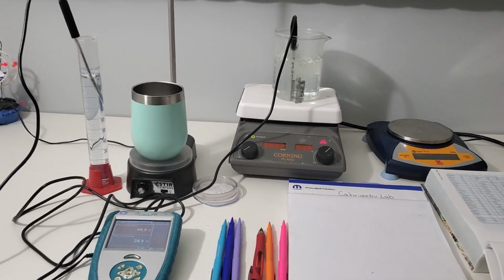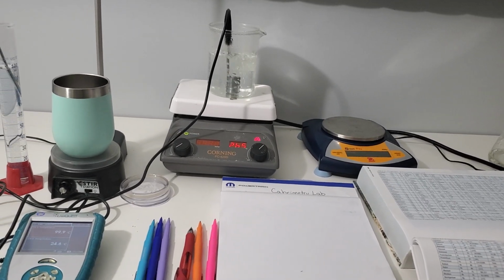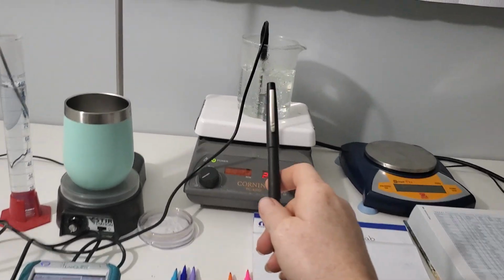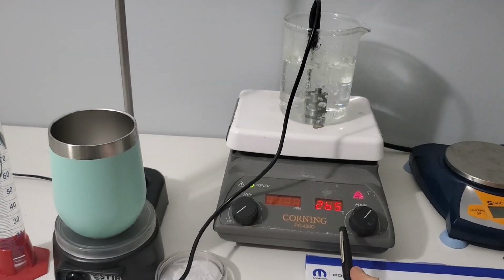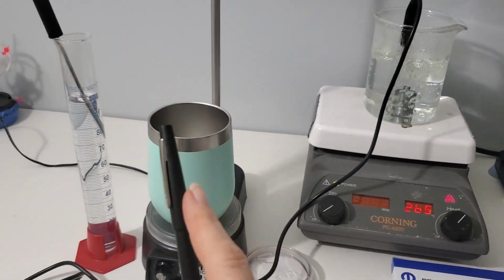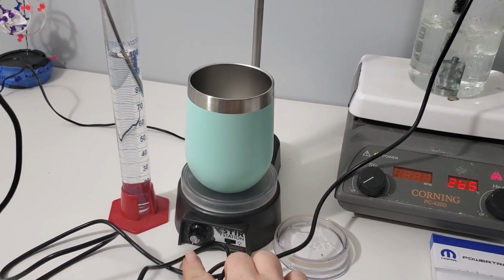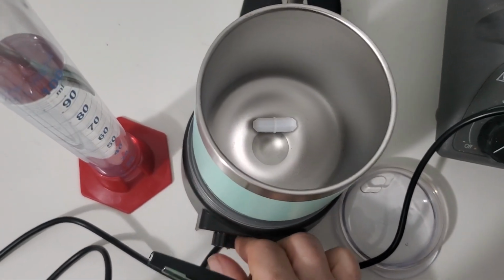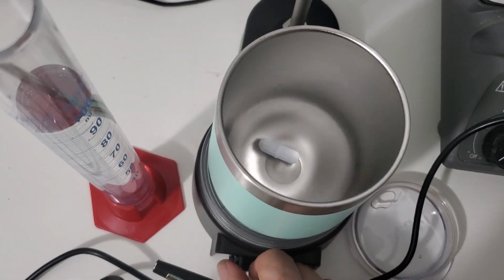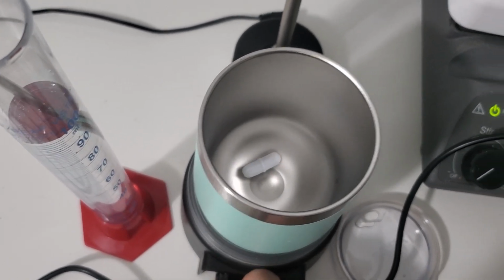All right, so we are going to do the calorimetry lab. I've got a couple things gathered. I've got 2 thermometers, the heating plate. I have a cup with a lid, and then this is a stir. I've placed a little metal, it looks like a pill, and when I turn this on, it'll stir it so that way it can keep our liquids moving.